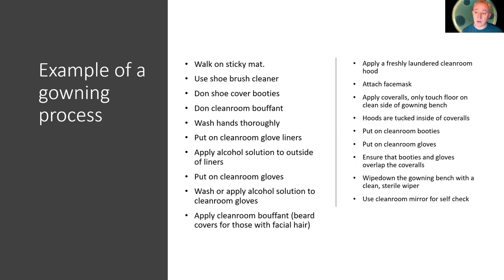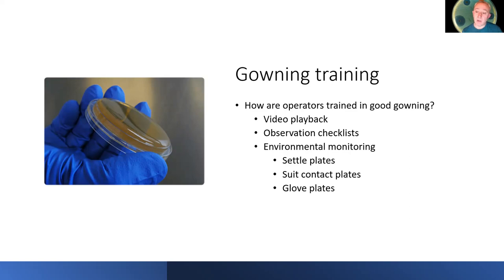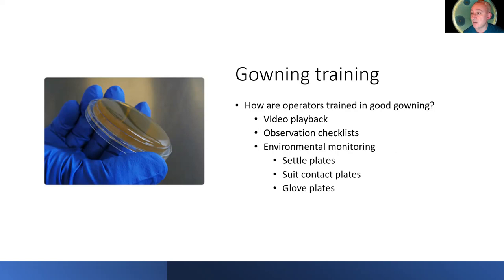Effective gown training is really important for understanding the contamination of the operator, particularly for trainees. Video recording showing the trainee what they're doing and then matching that with best practice video is useful. Observational checklists should be used, and environmental monitoring should be undertaken at the point of gown training and then for periodic gown qualifications, which would typically be every six months. We'll use settle plates to show what might be deposited during the gowning process, suit contact plates after the gowning exercise, and finger plates to confirm whether the operator has an effective glove sanitization technique.